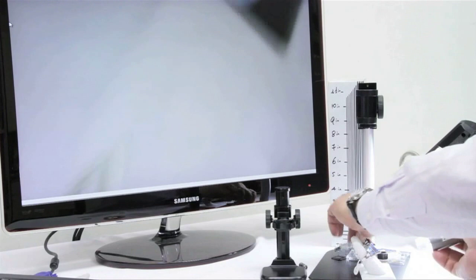Here's another example. We're using a spark plug and looking at it at 50 times magnification.